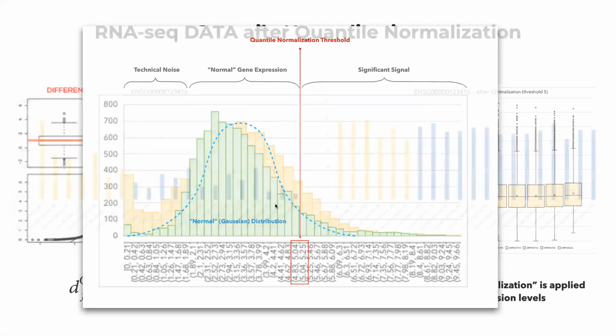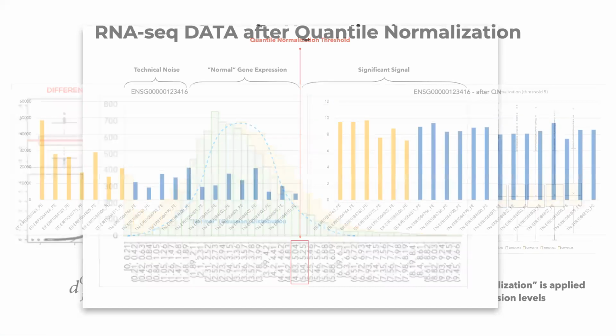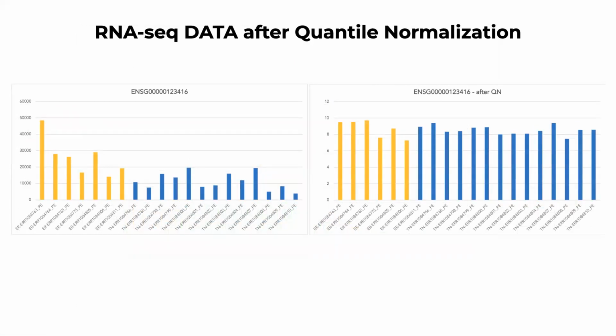So here's an example. Here are a couple of genes. You can see that it's the same gene before and after quantile normalization and log normal transformation. When we look at it in raw scale, we might be tempted to think that there's a difference between this condition and this condition. But the difference is primarily a result of variation within one group of samples, right?